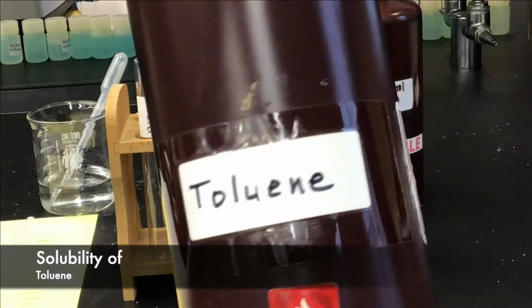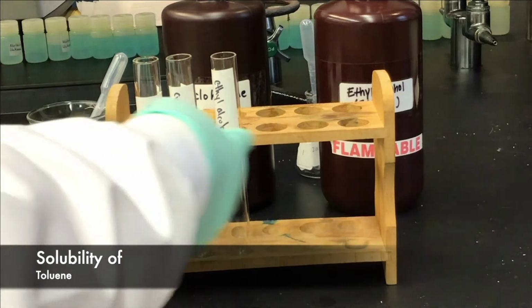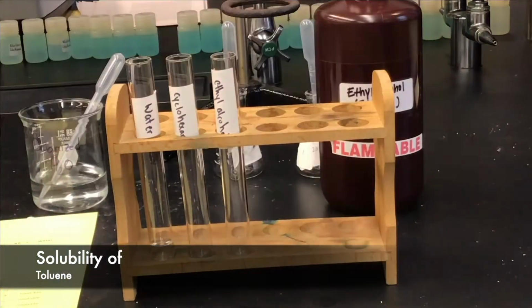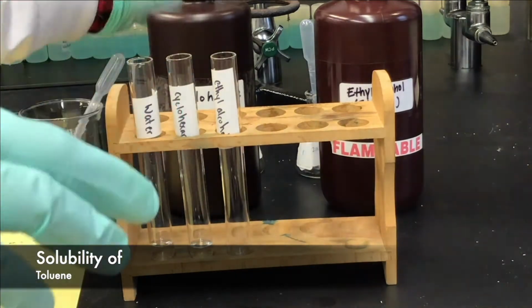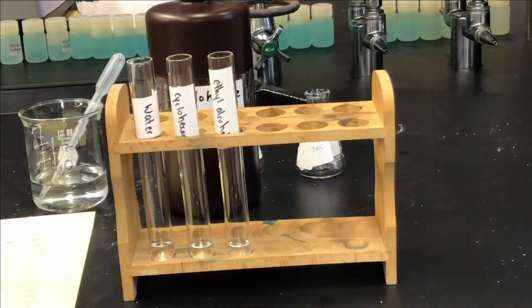Now we're going to test the solubility of toluene, which is a liquid. We're going to follow the same procedure that we did before, adding 2 to 3 milliliters of water, cyclohexane, and ethyl alcohol to the respective labeled test tubes.